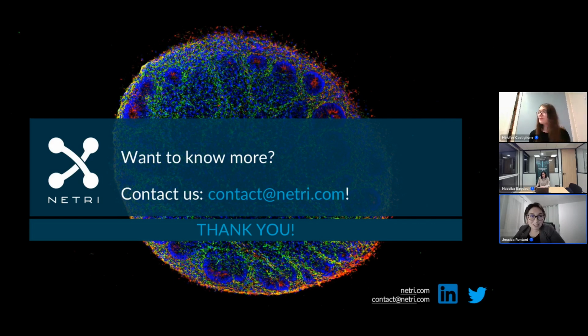As Eloise presented before, we used a regionalized differentiation protocol for cortical organoids. But we have also tested the unguided protocol from Lancaster and collaborators with a Matrigel embedding of the organoid. So yes, the duplex device is compatible with the use of hydrogel. Okay, thanks.